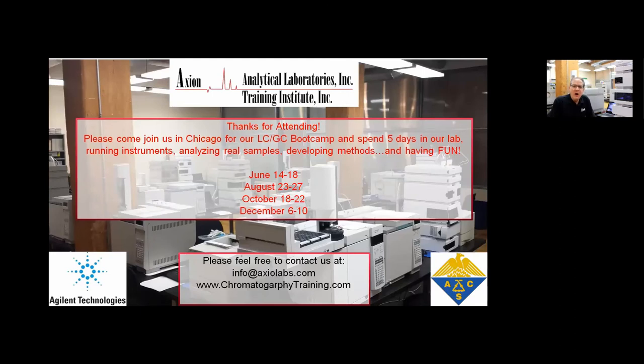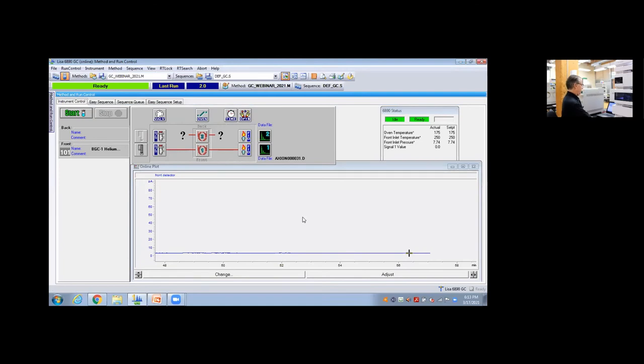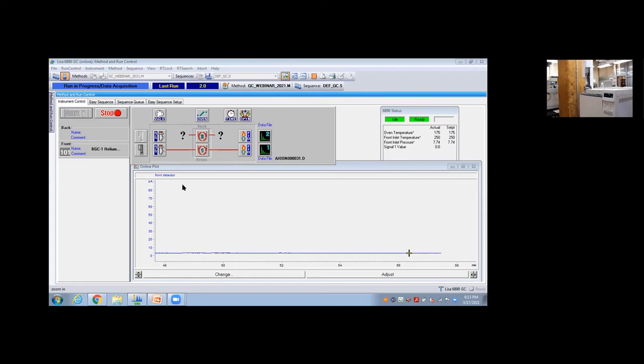So thank you for listening to this stuff, but now more importantly, let's go ahead. What I'm going to do is I got my GC, which has been patiently idling here in the background. So right now I have it set up with helium. I'm going to go ahead and tell it to start so we can start an injection. Just in case you're bored there and want to see some real chromatography. So here we're going to make a very small injection. I think it's a 0.2 microliter injection of a hydrocarbon mix. It is three hydrocarbons. C14, 15, and 16 in hexane. So again, this is helium. We'll have a typical chromatogram in here in just a moment. I believe the time is about one minute.